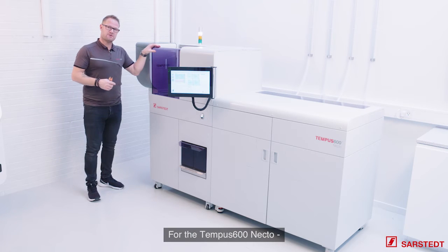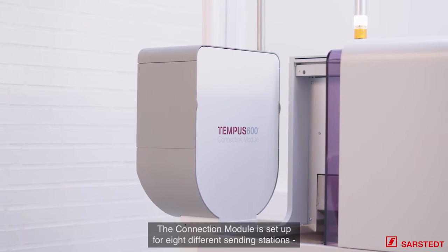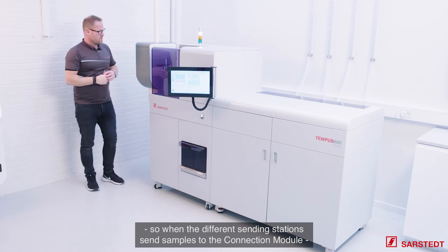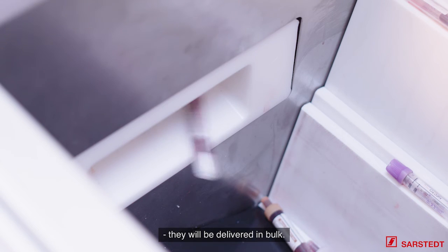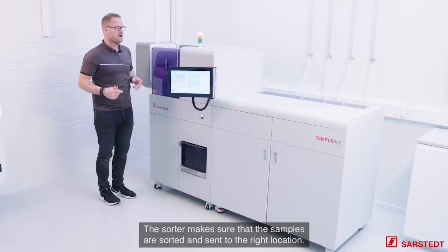At the Tempus600 Necto, you also have the opportunity to add a connection module. The connection module is prepared for eight different sending stations. When the different sending stations send the samples to the connection module, they will be delivered into the bulk, and the sorter makes sure that the samples are sorted out to the right location.